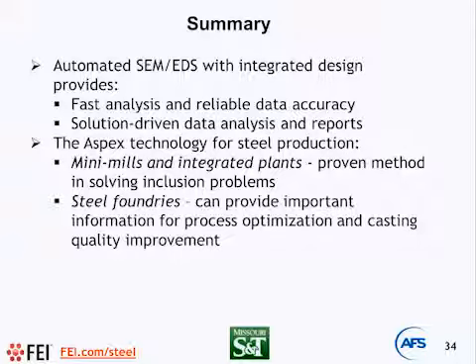And without that critical information, it's really difficult to control, modify, and engineer the inclusions to meet the specific needs in either steel mills or foundries. So I don't have a good answer on how to optimize the quantification of inclusion data for the optical microscope.